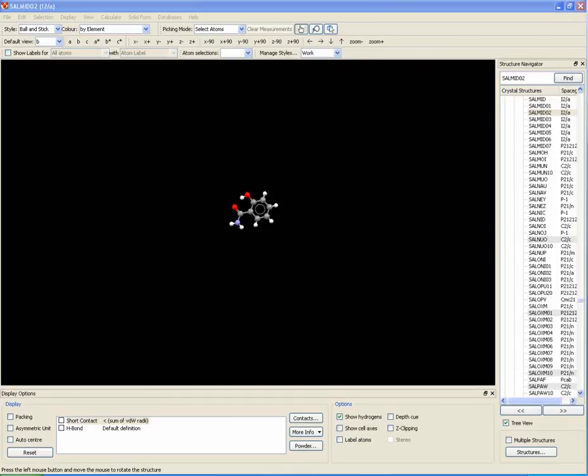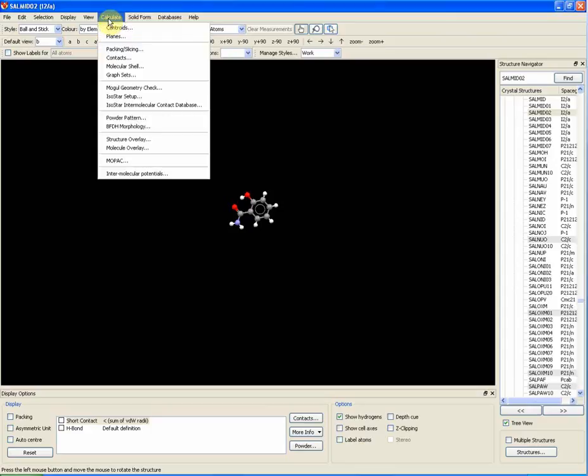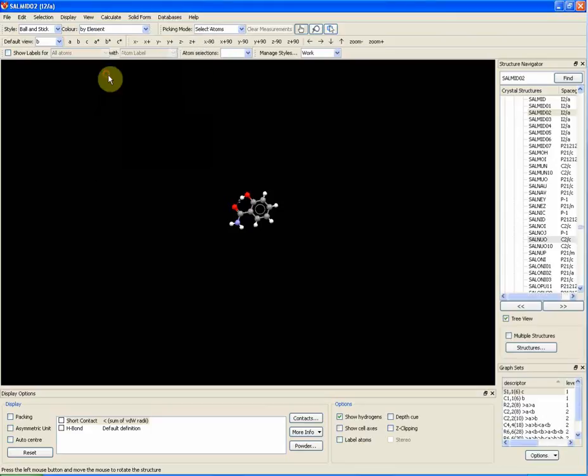How to display hydrogen bonding graph sets. To display hydrogen bonding graph sets for your chosen molecule, go to Calculate, then press Graph Sets, and the Graph Sets box will appear in the bottom right of your window.